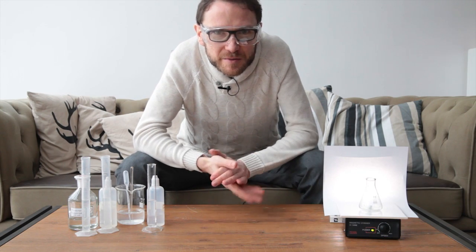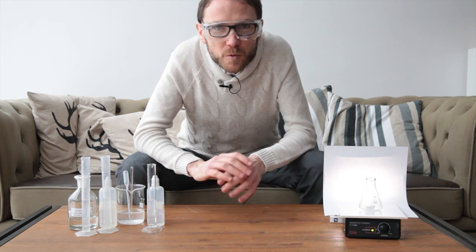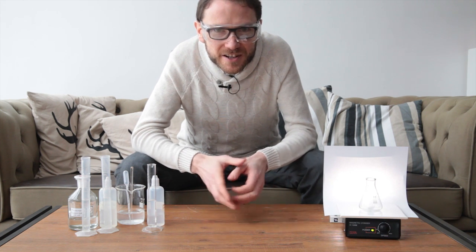Welcome to Couchtop Chemistry this month. I can't believe it's taken me this long to get around to doing this. We're going to be looking at one of the most iconic chemistry demonstrations of all time: the Briggs-Rauscher oscillating reaction.